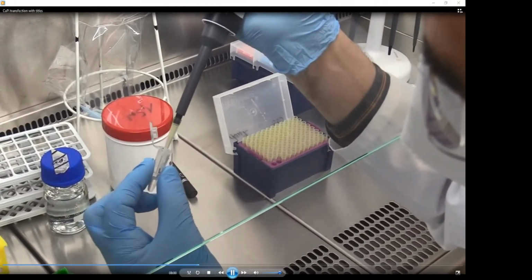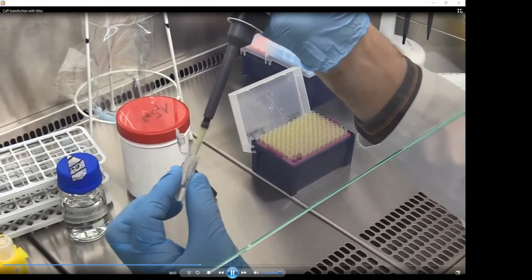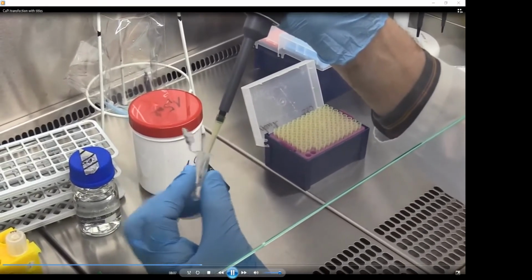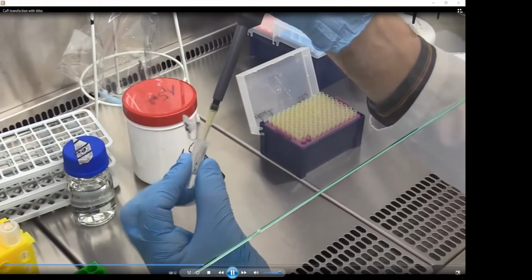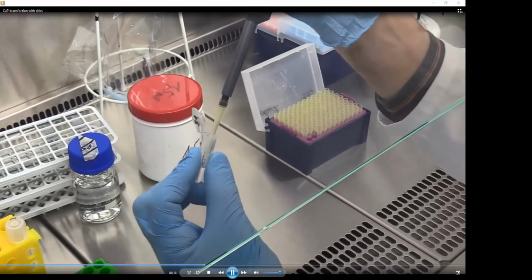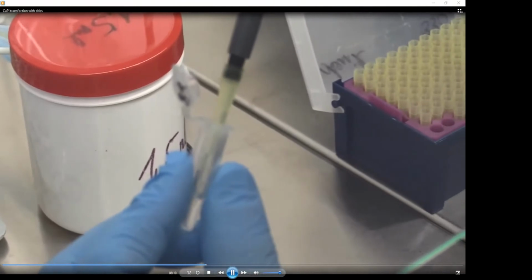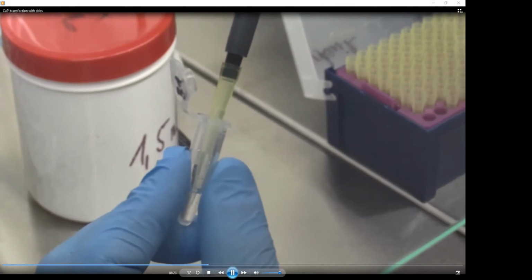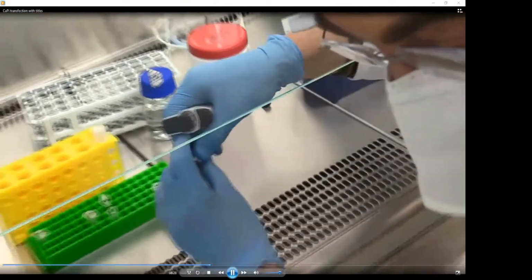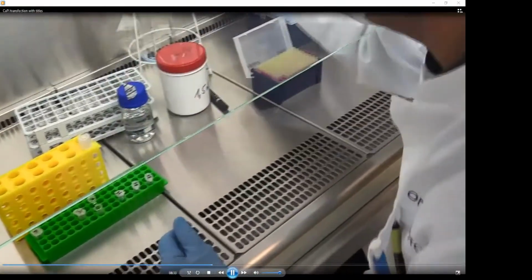What is necessary to notice here is that when you combine calcium chloride with DNA, you have to do it dropwise, because that gives the best opportunity for interaction between calcium chloride and DNA. Then you have to mix it 5 times up and down. This is written in the protocol. It's also an important step because then you know that the technique is reproducible.